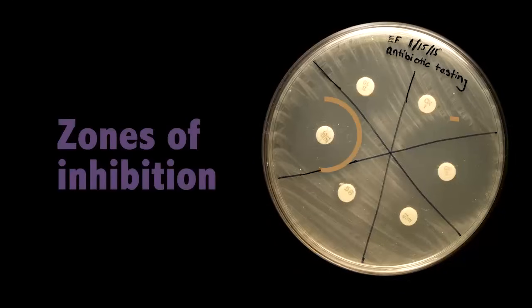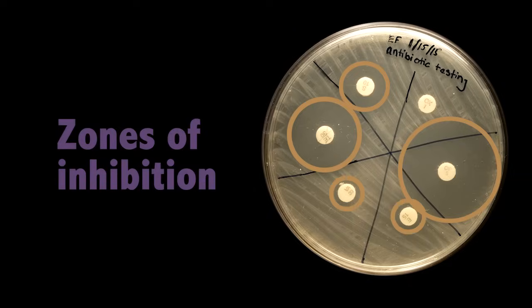After the bacteria have grown, you can see clearings around the antibiotic discs. We call these the zones of inhibition. The bacteria are only susceptible to some kinds of antibiotics. The purpose of the Kirby-Bauer assay is to determine how susceptible the bacteria is to each type of antibiotic. Can you think of a way to measure the susceptibility?